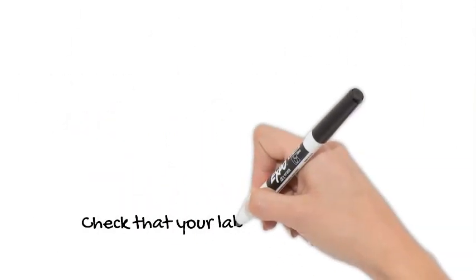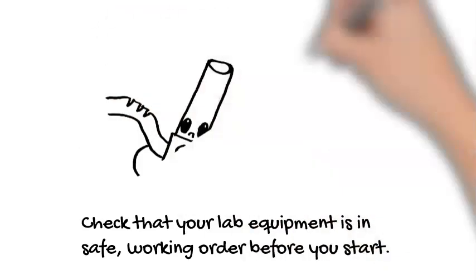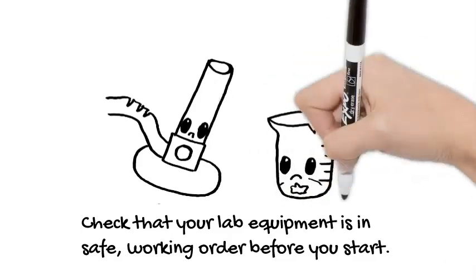Check that your lab equipment is in safe working order before you start. This means checking Bunsen burner hoses for any cracks and checking glassware for chips or cracks.